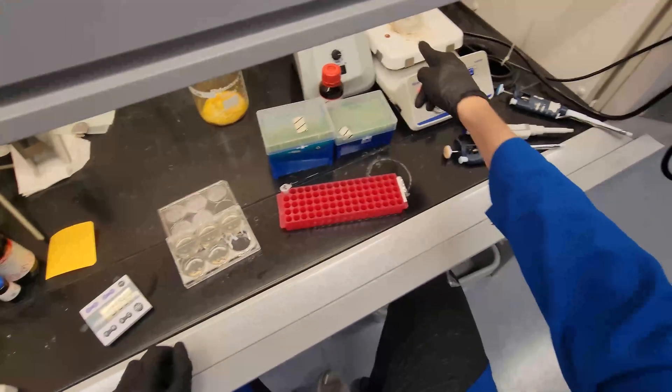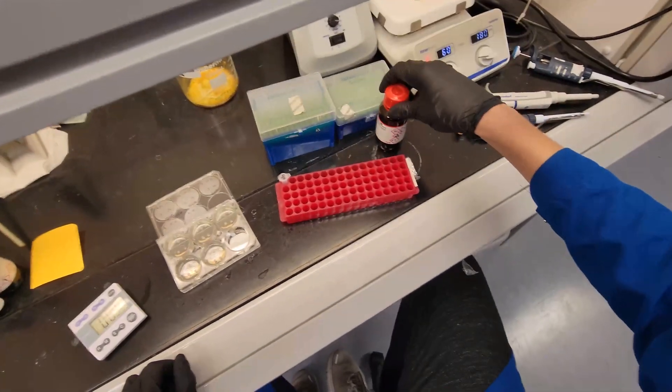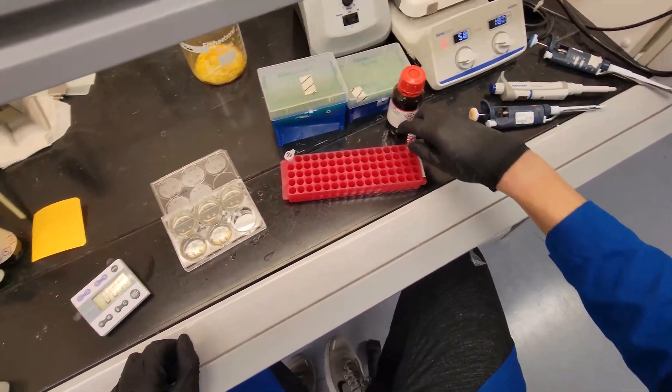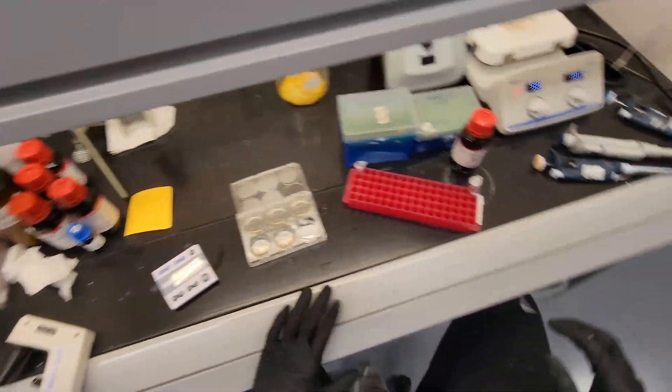So, I'm going to prop it up a little bit just so that that pooling chloroform isn't on the cells. So, we'll give that 10 minutes and then we'll add.